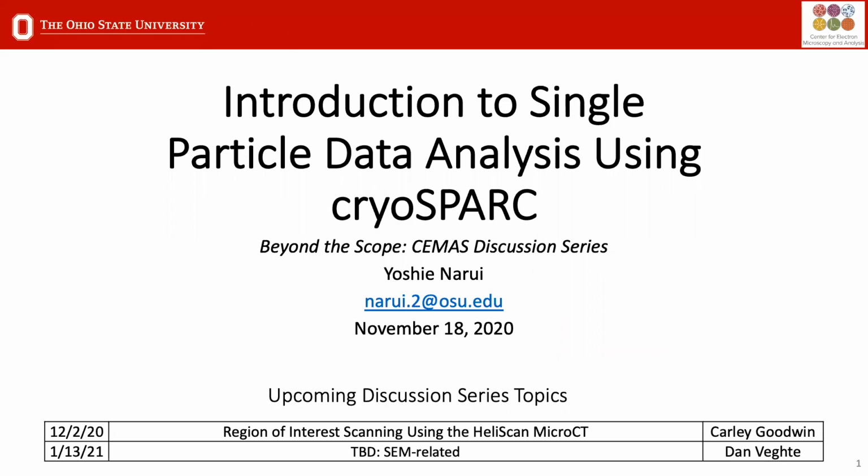Essentially what the dashboard is going to tell you is a summary of all the projects and workspaces and jobs that are currently being run or in total that you have. It also gives you links to the discussion forum if you have questions, and also the databases that hold Cryo-EM data are available to you here.